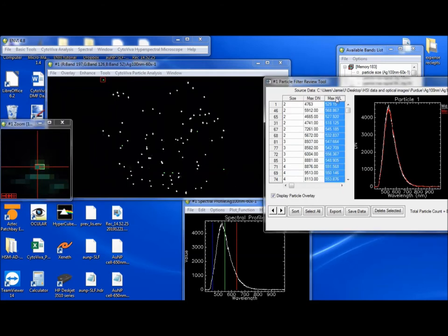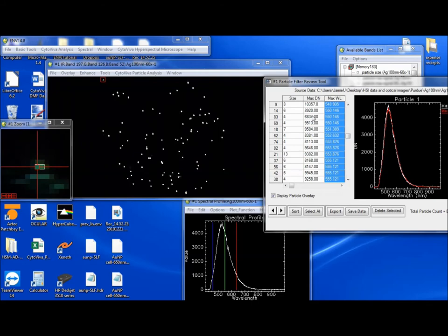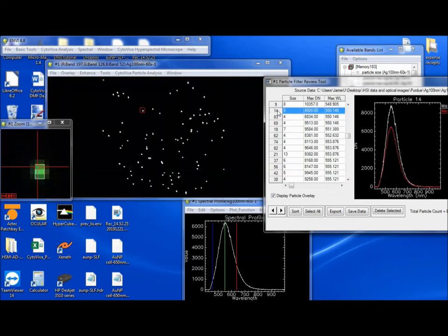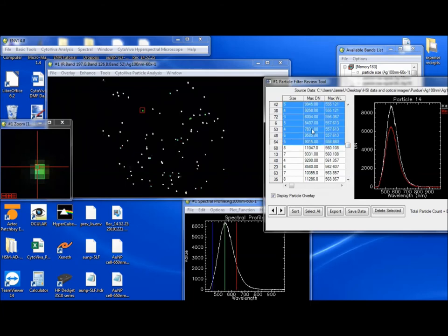So if you wanted to go to, let's say, wavelength and sort ascending and say, okay, I want to look at all the particles that are between 550 and 560. So we come to this one, hold down shift. We go to this one to 558. These are all the particles that have data between 550 and 560.